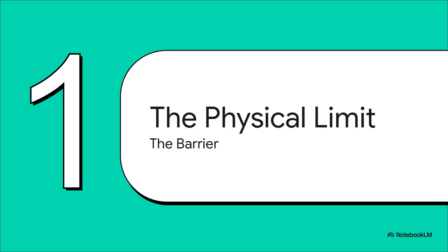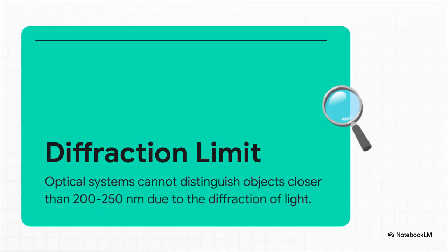To really get how this digital wizardry works, we first have to understand the physical law it's breaking. See, there's a very, very good reason why that image on the left is so blurry. It's not a flaw in the microscope, it's a fundamental barrier of physics itself. It's called the diffraction limit, and this idea goes way back to the late 19th century, figured out by scientists like Ernst Abbe and Lord Rayleigh.